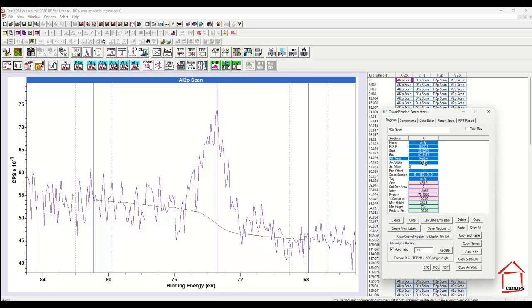Using a larger number of average width points means that you stabilize the background and therefore the calculation of the background is more precise and consistent. And we get a better trace within the depth profile that's calculated from these aluminium data.